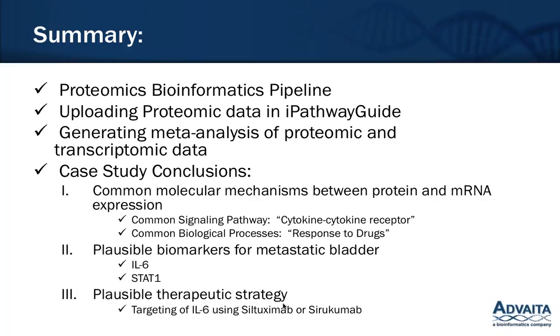If you are interested, you can compare 2 protein samples versus 2 RNA samples. I just did a 1-to-1 comparison, but you can compare and contrast up to 5 different experiments in the meta-analysis feature of iPathway Guide, protein or mRNA data sets.